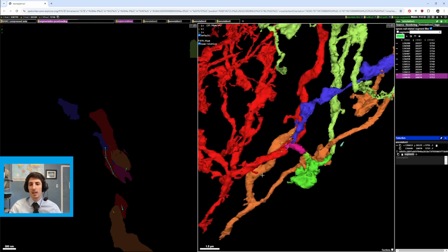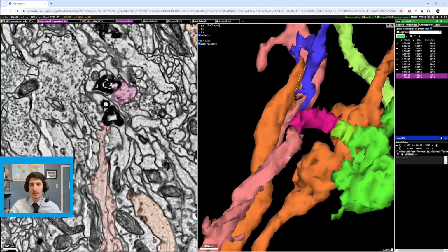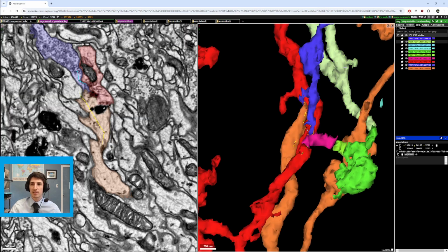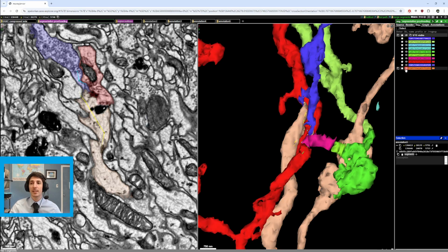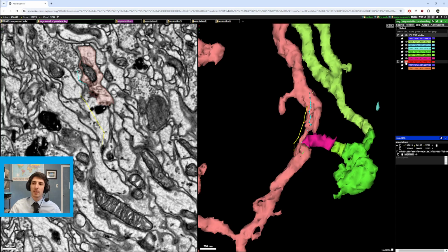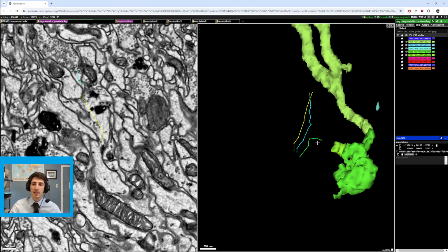So let's take a look at what we have. We have this red cell, and let's take a look at the segmentation here. If you hit the star, you can make it disappear. That's not what I wanted to do, but we know where it is. If you hit the eyeball, you can make it disappear, but not off the list forever. And we can hit the eyeball here, there, and here. So that's what the trails look like without those cells on.